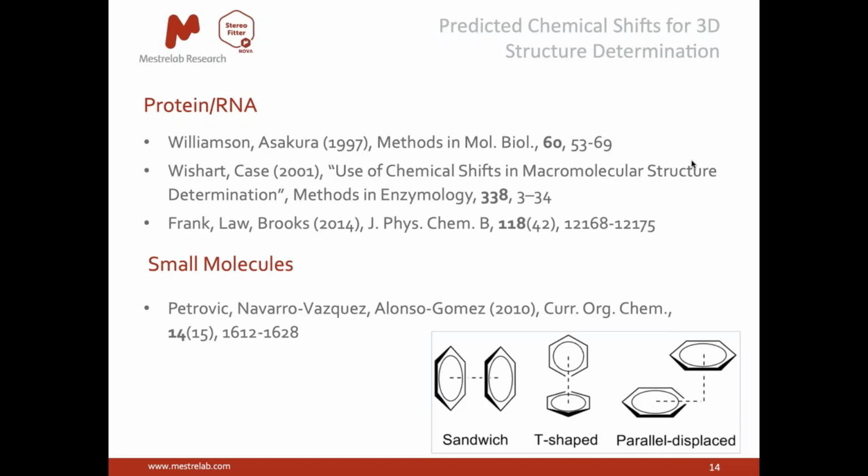There have been chemical shift calculators around for a very long time that only take into account the bonded nature of a structure. But as we all know, that is not how the real world works, and chemical shifts are as affected by through space effects nearly as much as they are by through bonds. Now, the picture at the bottom is the simplest one I could find that nicely hints at how chemical shifts could be affected by ring currents of neighboring aromatic rings in different orientations.